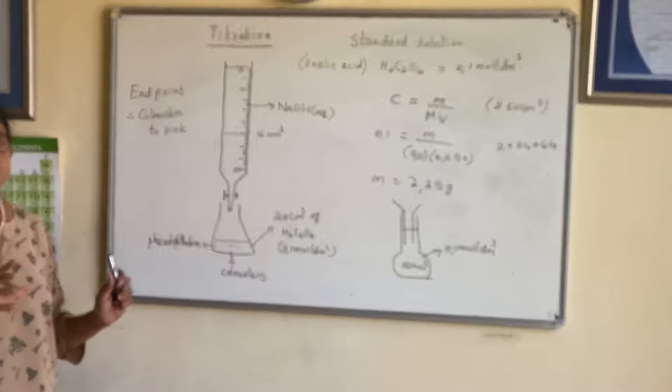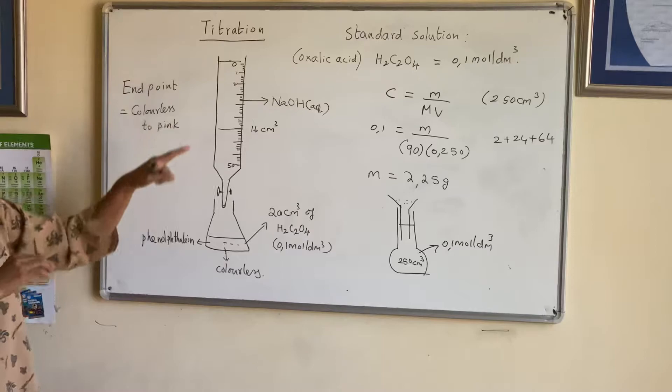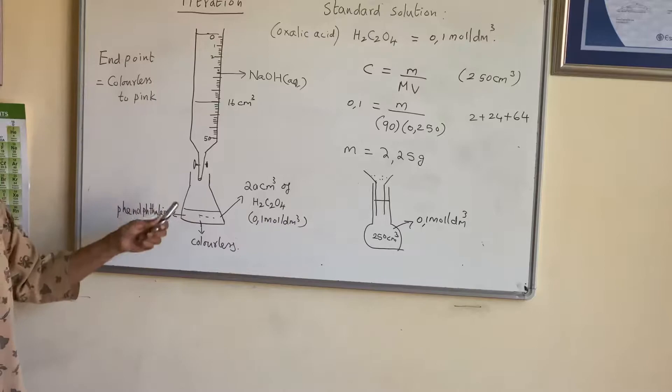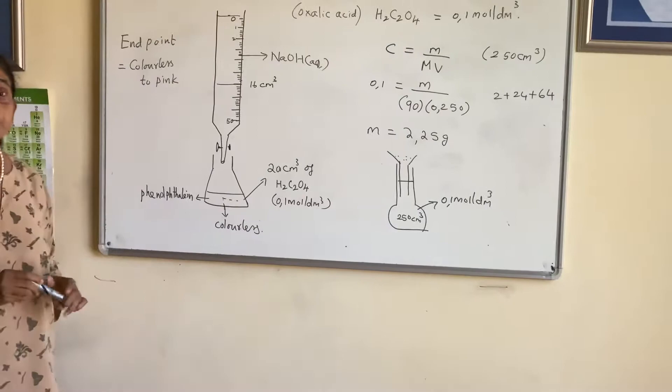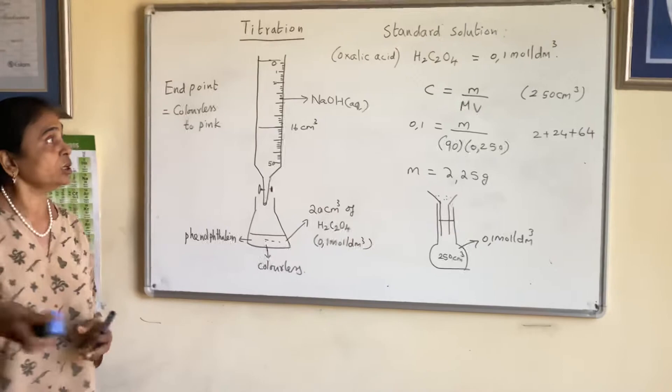The first time you may make one or two mistakes and not reach the correct point. Now you know the volume is going to be around 16 cm³. Refill the burette to zero and start the titration again carefully. When nearing 15 cm³, add drop by drop to find the exact point where the color changes. Repeat the process three times, find the average, and use it for calculations.